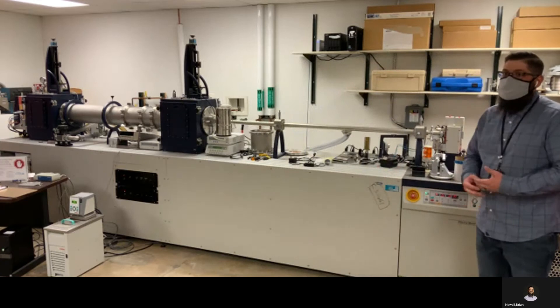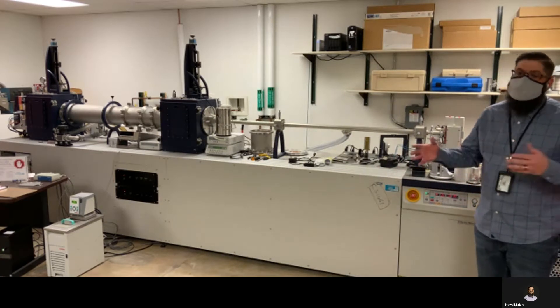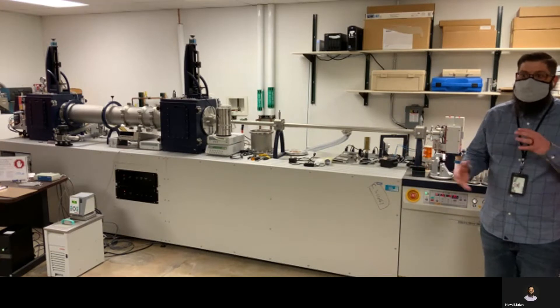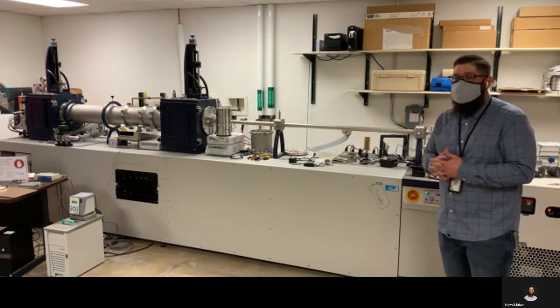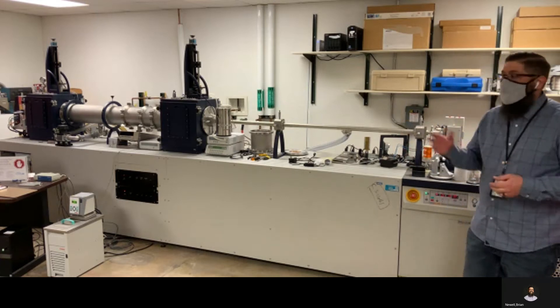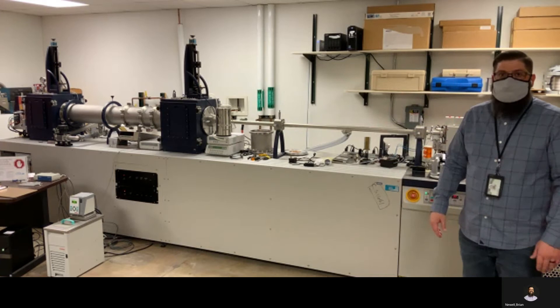A lot of folks that use this are polymer chemists. They're looking at spacing and how the morphology changes with heating. We have a temperature stage that can go up to 350 degrees C. We can also use liquid nitrogen to cool down to liquid nitrogen temperature if that's desired.